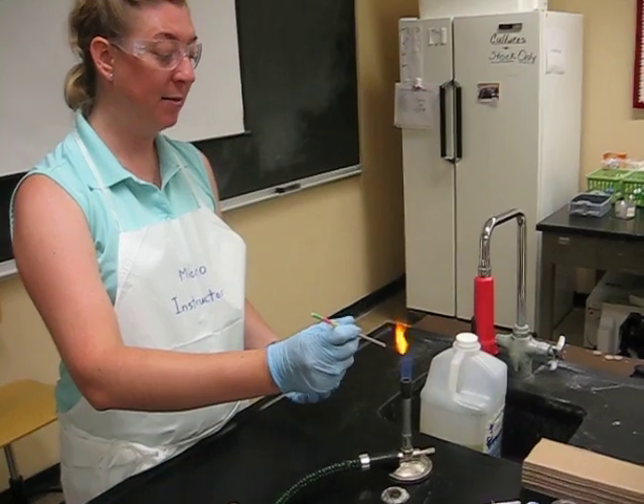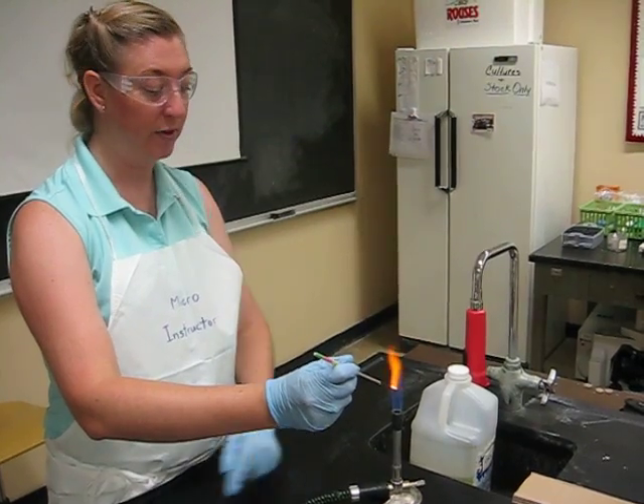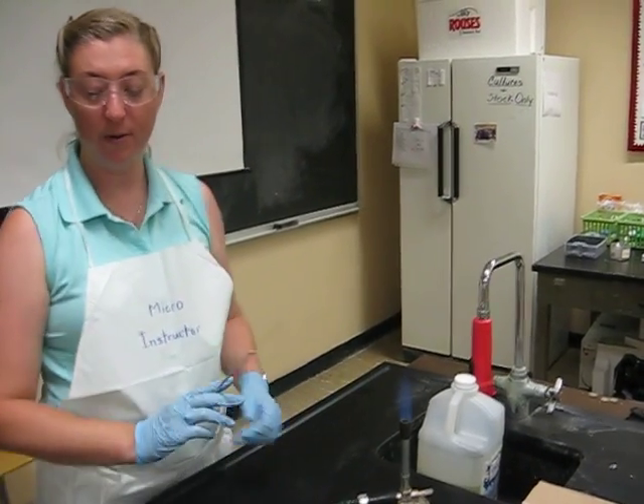So we did aseptic transfers from several different types of media that we commonly use — mostly slants, sometimes broths, and occasionally a plate. And that's it for this one.